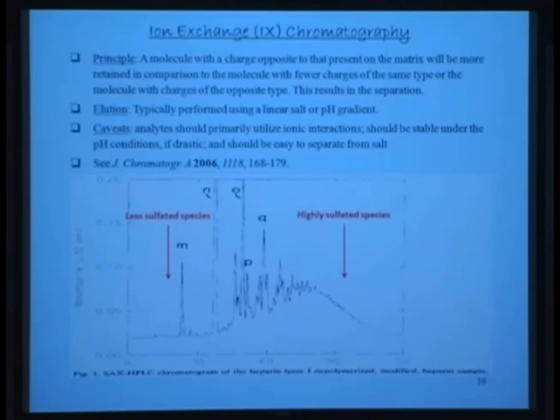See that? This is in essence heparin lyase 1. Only one enzyme has been taken, and we have depolymerized heparin. I don't exactly remember the conditions, but in essence you can see that this is the strong anion exchange column. This is the Mono Q column.